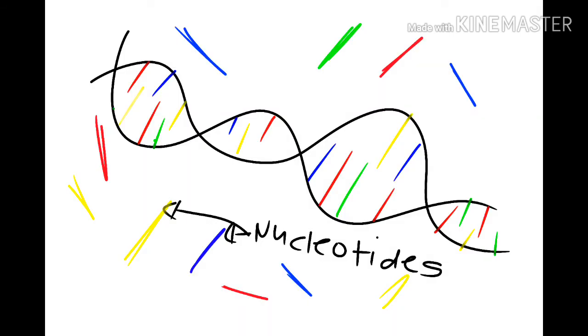In some cases, it doesn't. However, if we want to express the gene in bacteria to make a protein, the gene must point in the right direction relative to the promoter or control sequence that drives gene expression. If the gene were backwards, the wrong strand of DNA would be transcribed and no protein would be made. Because of these possibilities, it's important to collect plasmid DNA from each colony and check to see if it matches the plasmid we were trying to build. Restriction digest, PCR, and DNA sequencing are commonly used to analyze plasmid DNA from bacterial colonies.